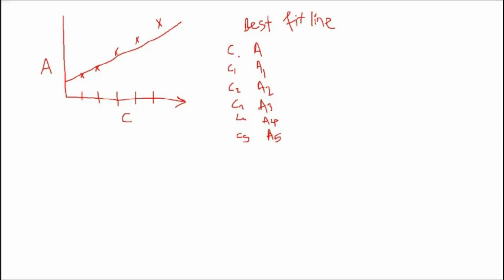So can we treat them as x coordinate and y coordinate of a point? This is x coordinate, and absorbance is y coordinate of a point on a graph. Can we treat them like x coordinates and y coordinates? Okay, Mama, Sushmita, Sajjad, Siddhi, they got it.